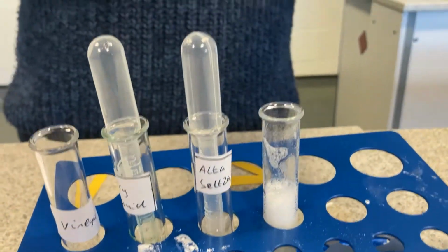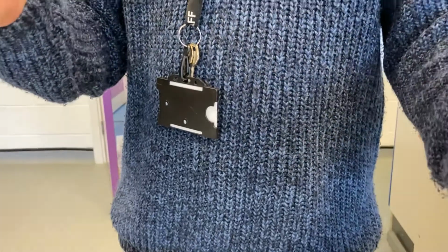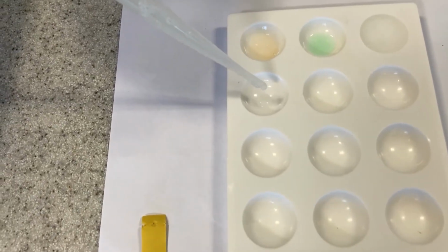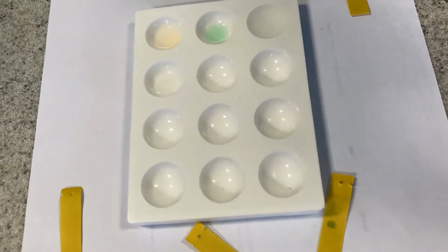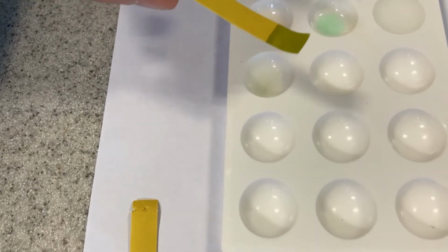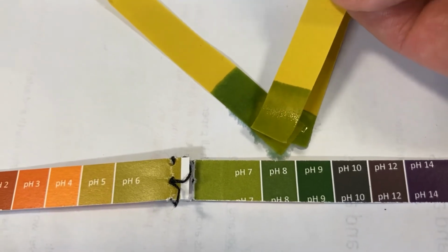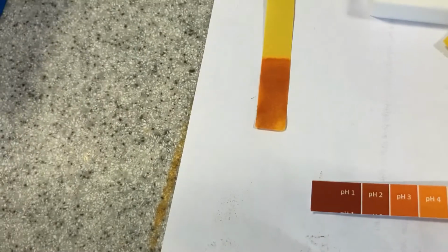Right, the last one, we are going to go for some milk. I have most definitely a clean pipette, and 1, 2, 3, 4. Are you happy with that, miss? Oh, thank you. Now then, pop that in there. Again, we've got some sort of weak alkali there. So several foods are weak alkalis, but the vinegar, and if we had lemon juice, that would be an acid.